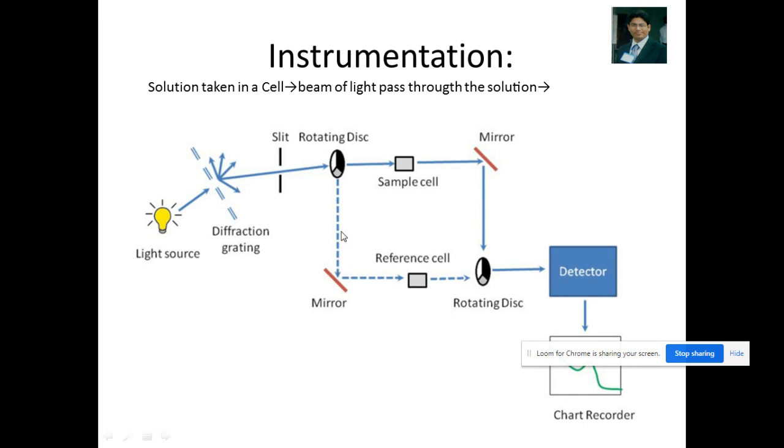One of the beams of selected monochromatic light is passed through the sample solution, and the other beam of equal intensity is passed through the reference solvent.